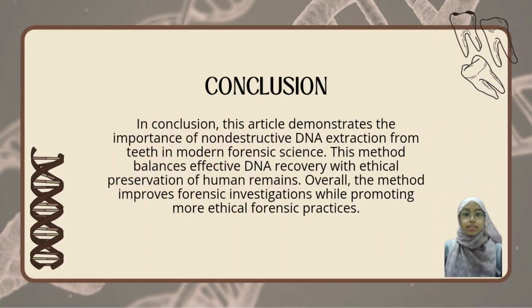In conclusion, this article demonstrates the importance of non-destructive DNA extraction from teeth in modern forensic science. This method balances effective DNA recovery with ethical preservation of human remains. Overall, this method improves forensic investigation while promoting more ethical forensic practice for the future.